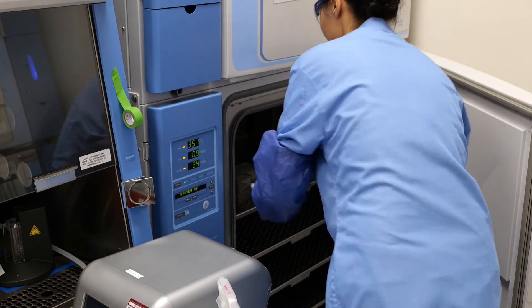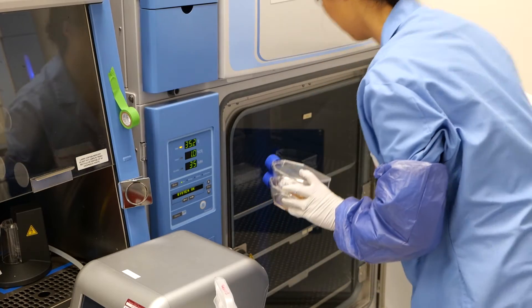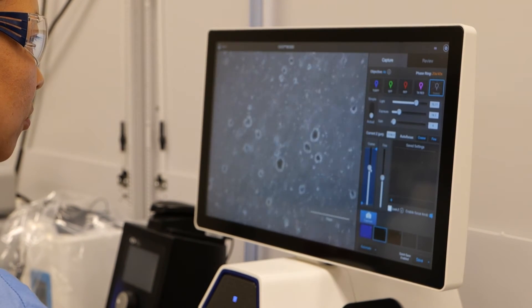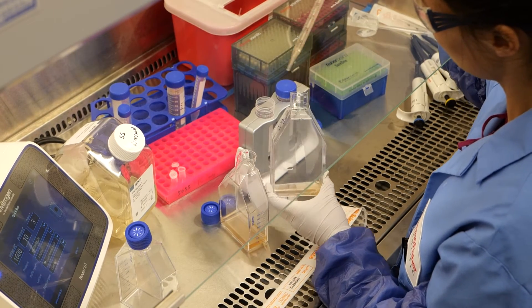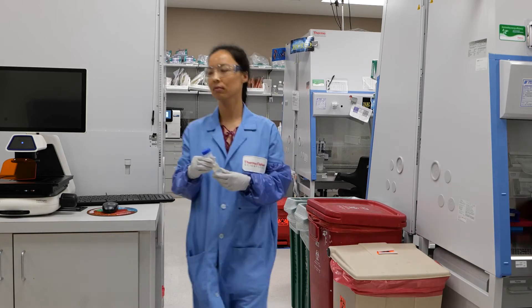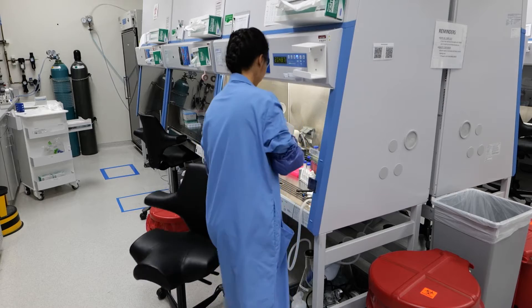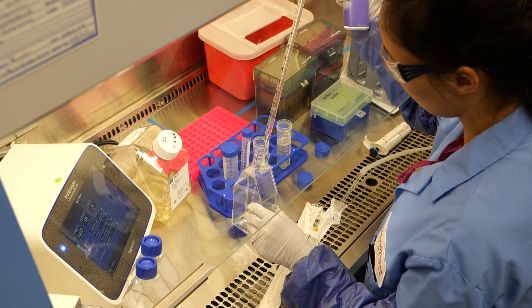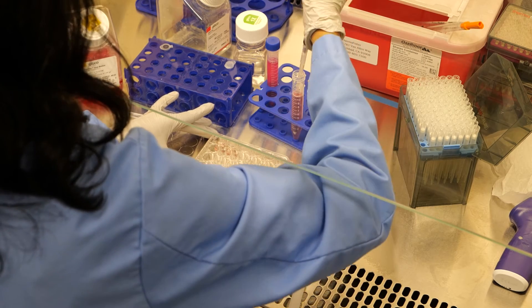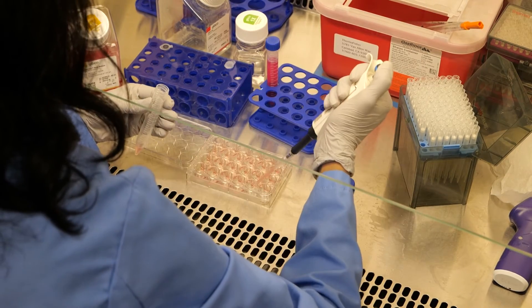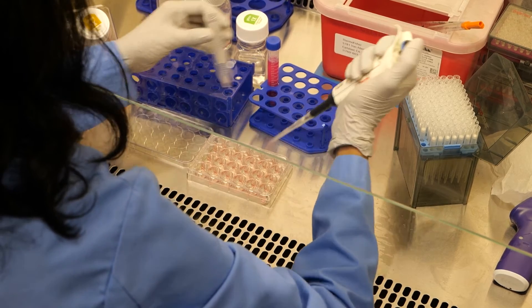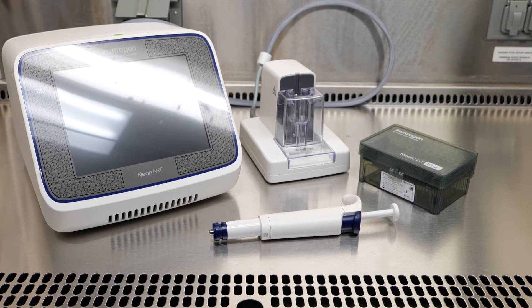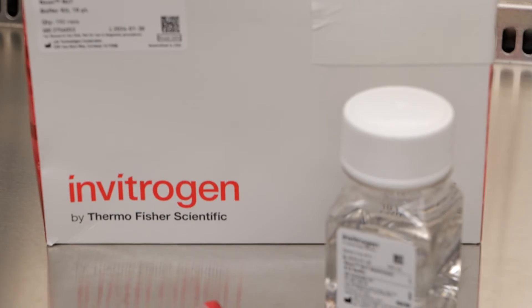After 72 hours, on the day of electroporation, the activation beads were removed with a magnet. Healthy activated cells will be densely packed into the activation beads. We will use a 24-well plate to plate our cells after transfection. After isolating the activated T-cells from the magnetic beads, cells are plated into OpTmizer T-cell expansion medium and placed in an incubator at 37°C. For this experiment, TrueCut HiFi Cas9, gRNAs, control gRNAs, negative control gRNAs, the Invitrogen NeonNext, NeonNext R Buffer, and 10 µL NeonNext tips are needed.